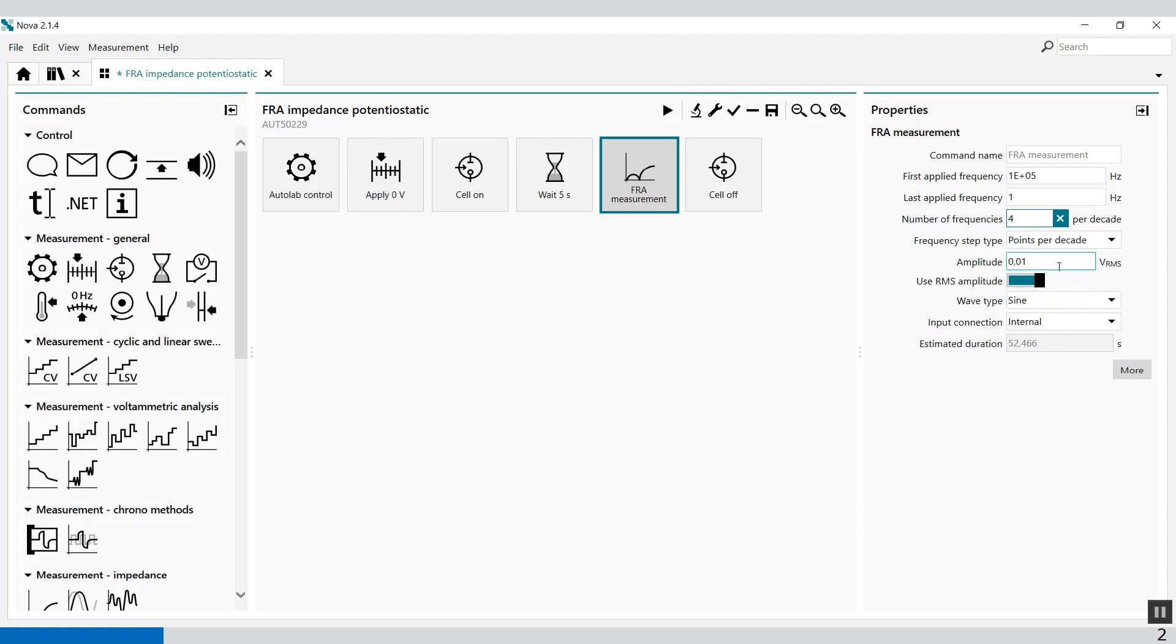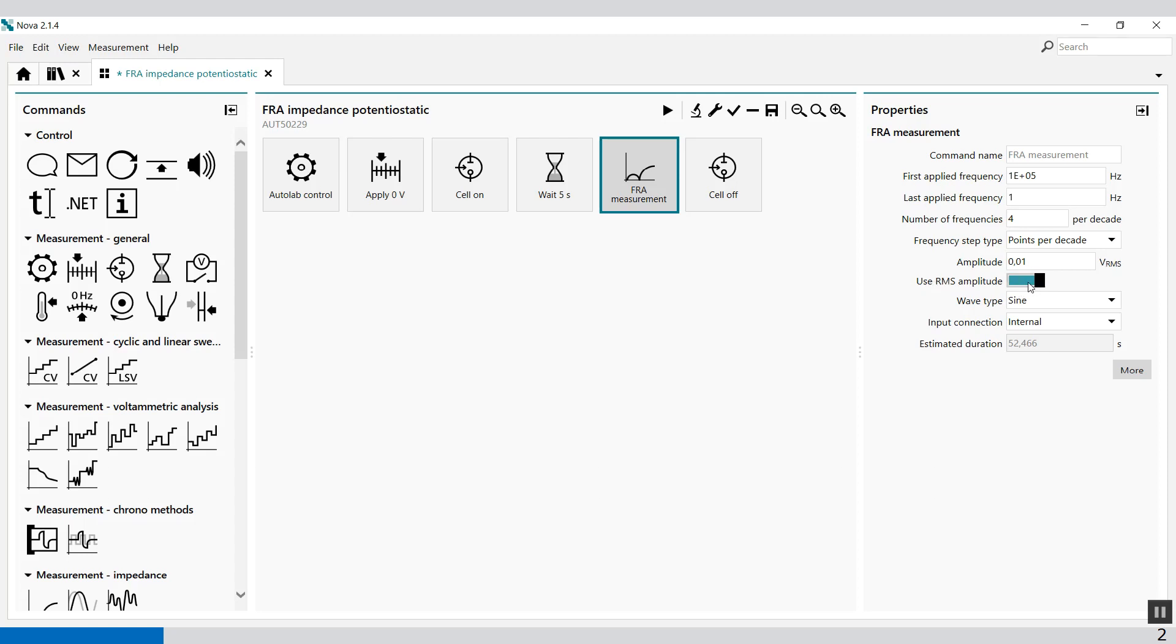The amplitude is set to 10 mV root mean square. Root mean square means you can select between the top or root mean square. Use RMS amplitude, and RMS means root mean square.